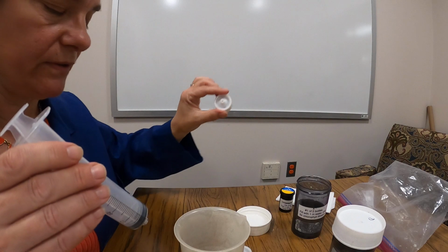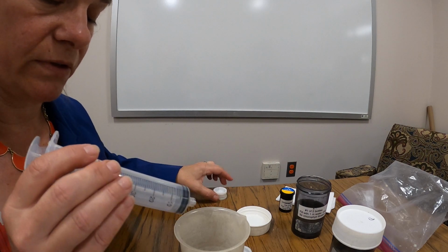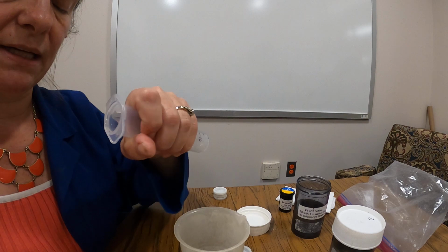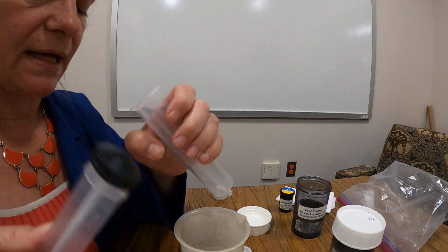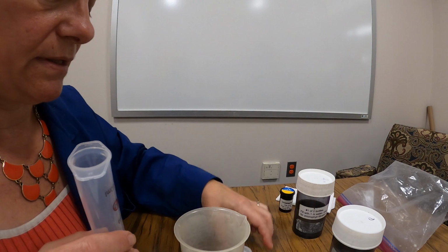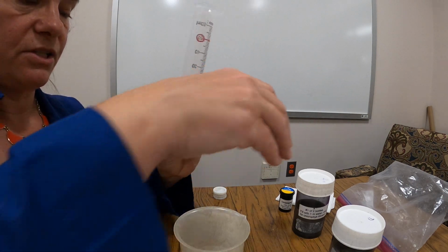I'm going to pull my filter holder off. And you want to make sure that you do not have your filter holder attached, because the next step is to pull that plunger back out again. And if that filter holder were attached, it would actually rip the filter when that suction happened. So I'm going to put my second filter holder that I have a filter in onto my syringe.